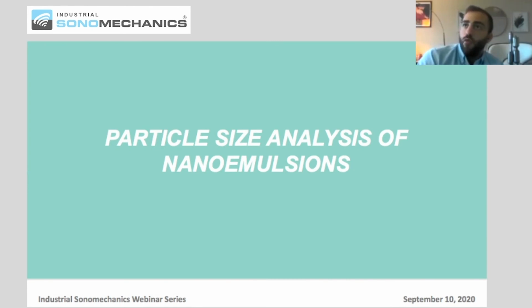Now my session for the description of nanoemulsions is complete. And before we touch upon analyzing nanoemulsions by particle size analysis, I'm going to throw this back to Eva for a few questions from the audience.